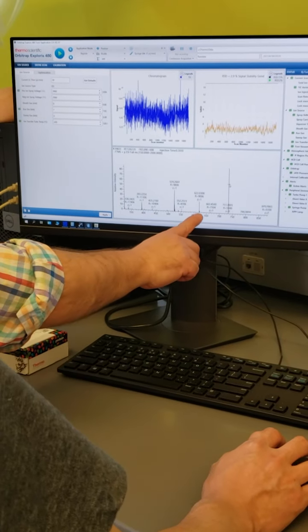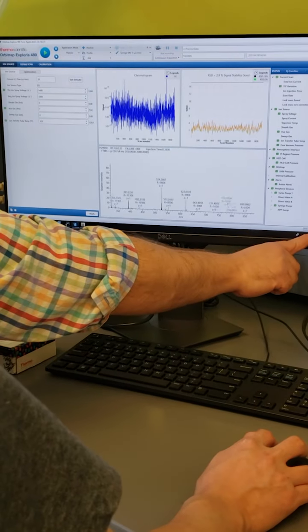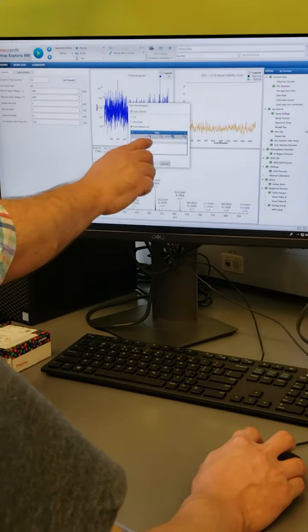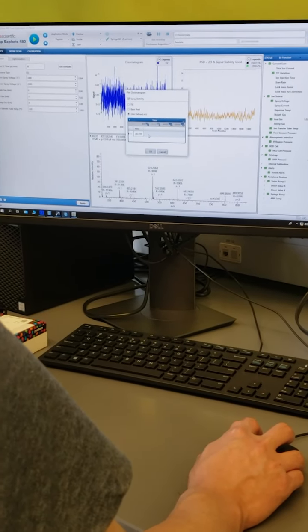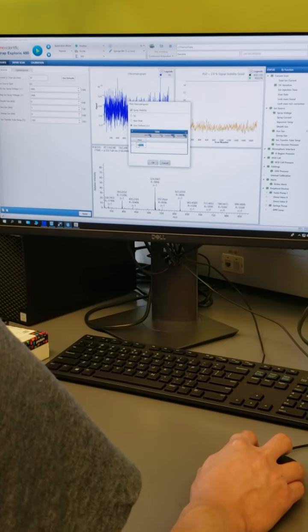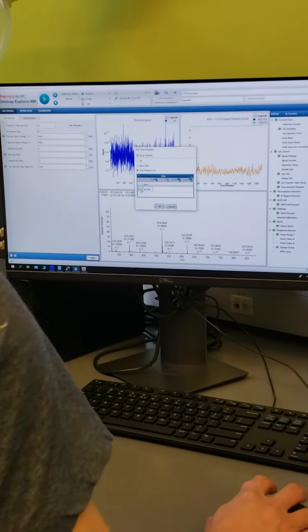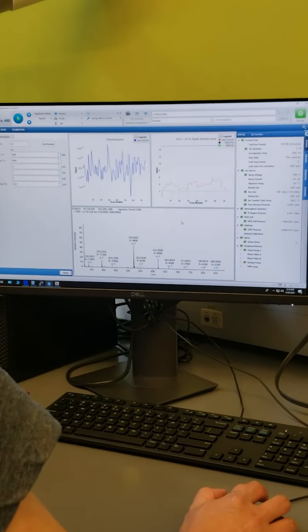All right, I want the 622.03. So go back and go ahead. We want to plot the chromatogram, and I want you to do the user defined peak of 622. So go ahead and add 622.031. So just type it in. Okay, click OK. Now it's going to give you a spray stability of one specific ion.